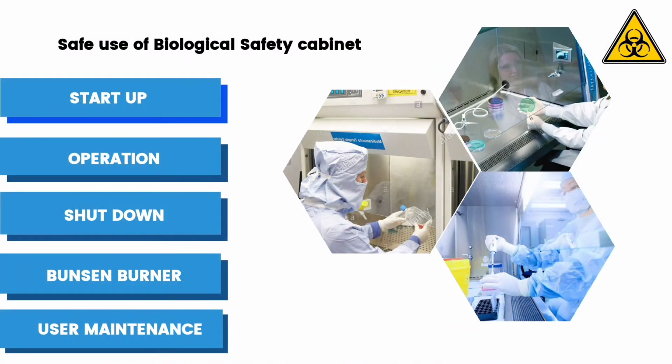What is the safe use of Biological Safety Cabinet? The safe use is based on startup, operation, shutdown, Bunsen burner and user maintenance. We'll see this in detail.